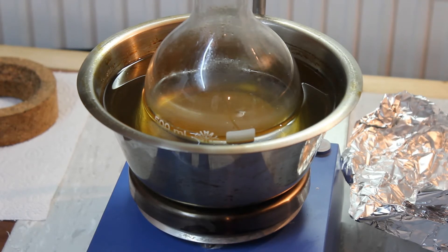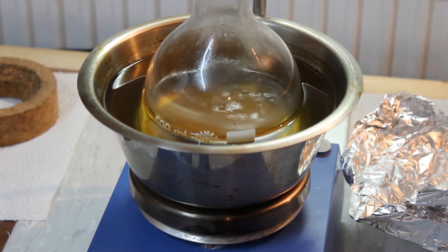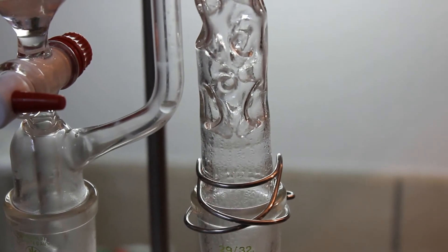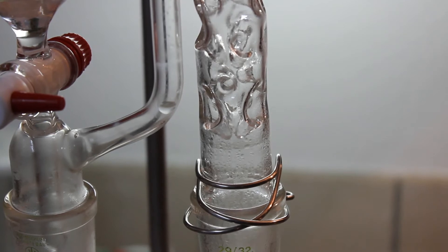So I'll monitor this and once it seems to reach a steady boil I'll back down the heating and we'll distill off our ether. We observed the first droplets of ether condensing on the bottom of the Vigreux column.